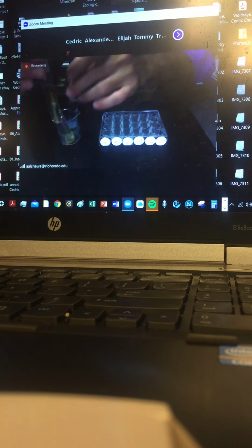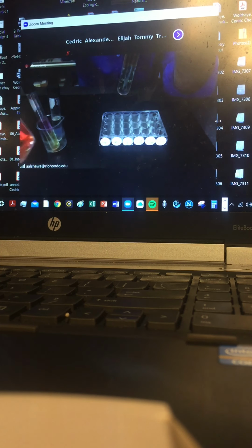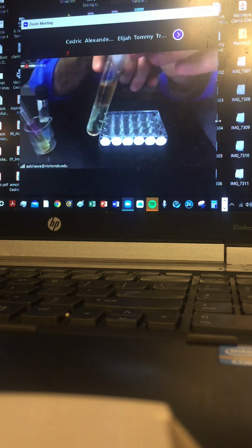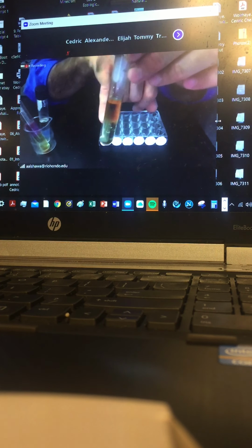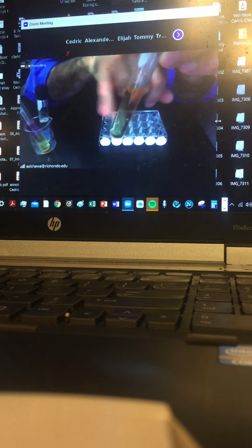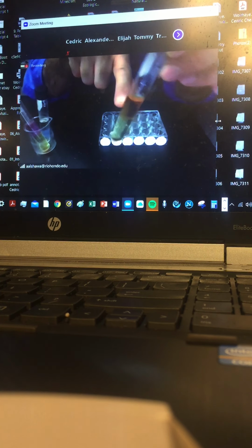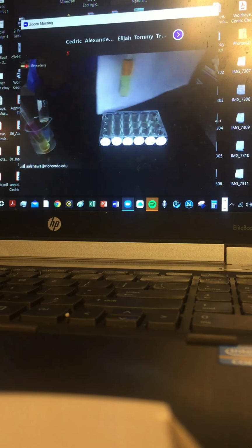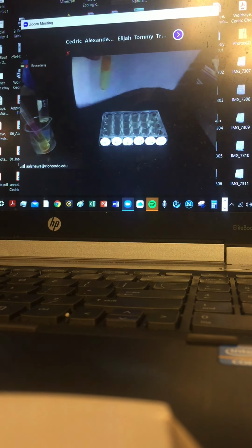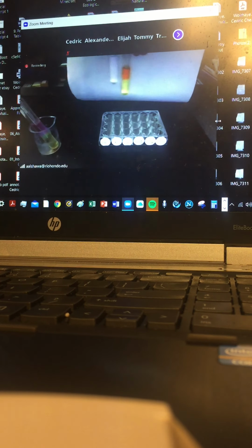Now, bromine and hexane. Bromine solution is a little more reddish, a rusty reddish. But once you add the hexane layer, a good number of the bromine will escape from the lower aqueous layer into the organic, because it prefers to be in the organic. Can you see the background color of it? So this is the background of the bromine, and that's the background of the chlorine.